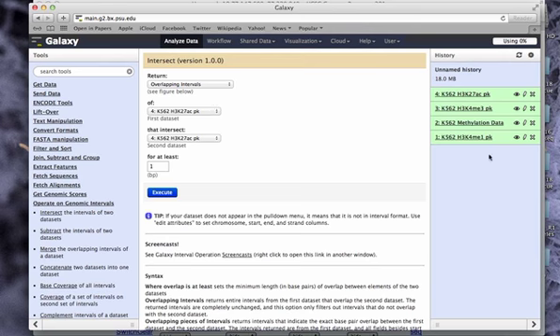So because your data is loaded up here, it's in interval format, it's within these drag down menus. So we're going to say return us the overlapping pieces of intervals of the K27 acetylation data that's intersecting K4 monomethylation. This is the minimum overlap in terms of base pairs that you need, so let's make it 150 to say that this approximates overlap of one nucleosome.